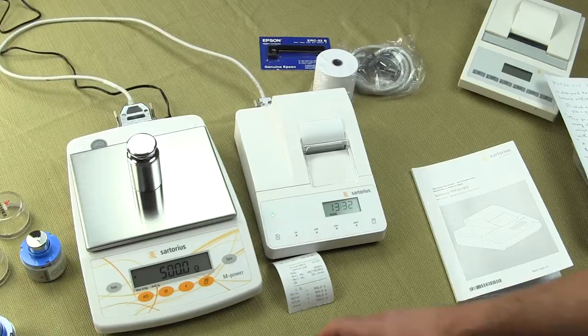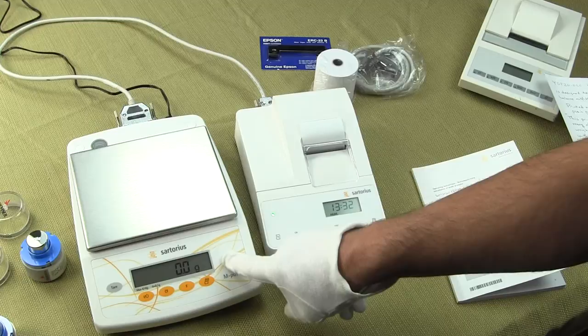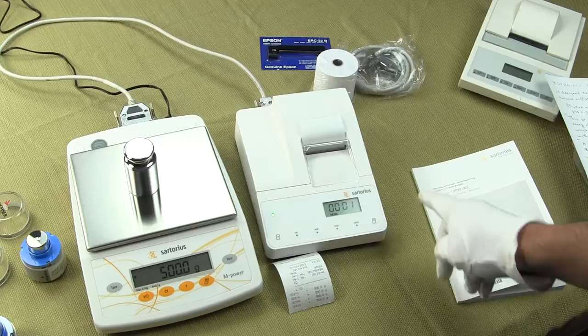I have this connected to a Sartorius balance already, and to send data is simply a matter of pressing the print key on the balance itself. Let me just place this 500-gram weight on it and tare the balance. If I want to send the data, I just simply press the print key and it sends it over to the printer.